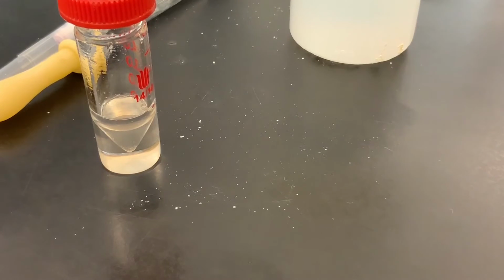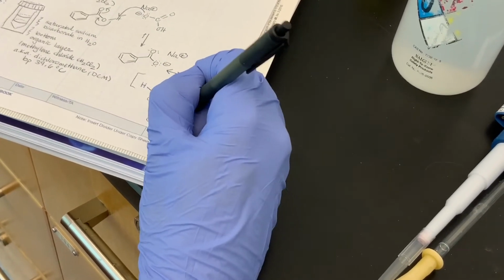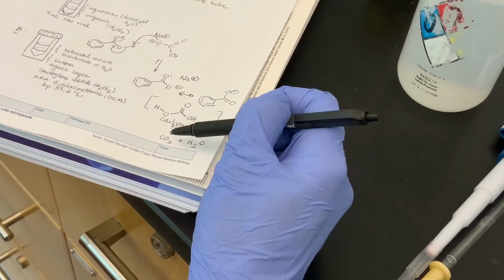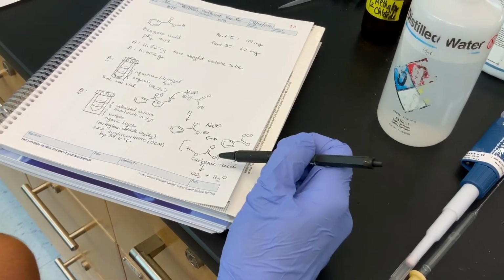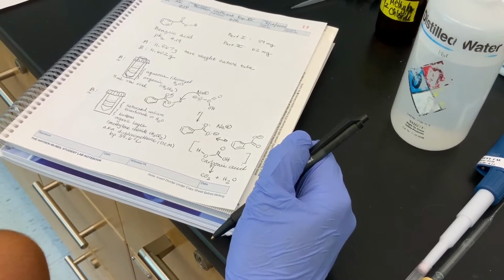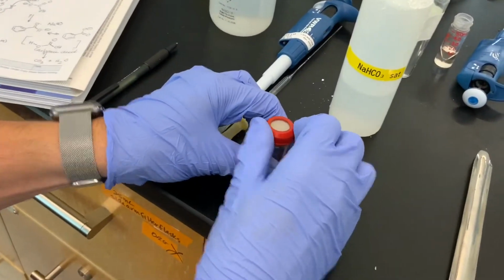So we can draw this now arrow, technically in equilibrium, but we definitely know that it's leaving as CO2 plus H2O, right? And what I just mentioned about making soda water, it's where you have a pressure of CO2 added into or bubbled into water to then get soda water, carbonic acid. And so perhaps some of you have seen those soda streams. That's exactly what's going on in there. And so let's just see this again, make sure it's sealed.